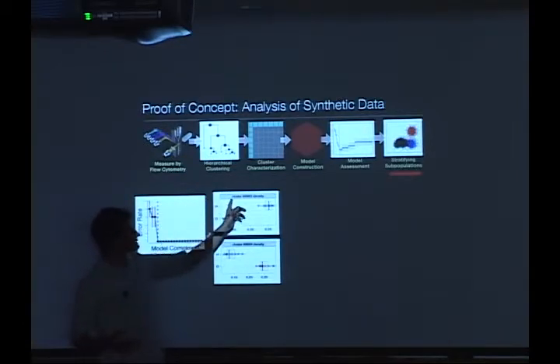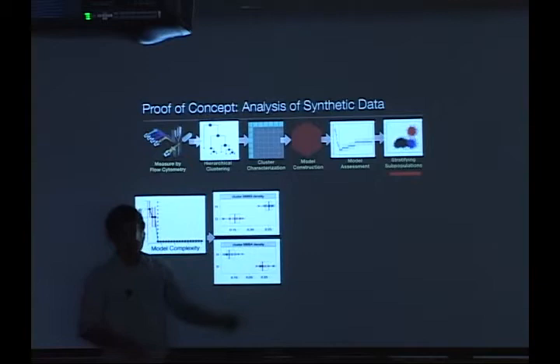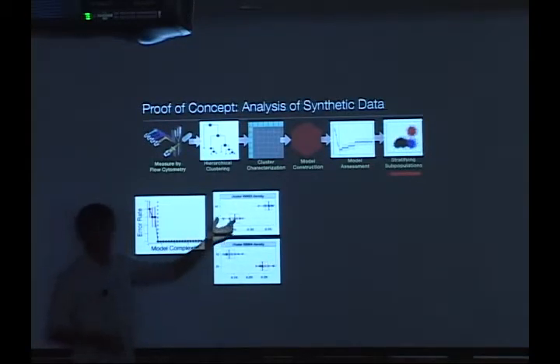So it'll say something like this. It'll say cluster 99993, which is just an arbitrary number. The abundance of that cluster is very high in healthy patients and very low in diseased patients. And so each dot here represents a healthy patient, as I specified, and each dot here represents a diseased patient. And we can see, yes, that the healthy patients have lots of cells in cluster 99993, and the diseased patients do not have a lot of those cells. And in cluster 99994, it's switched. Healthy patients don't have a lot of those cells. Diseased patients do have a lot of those cells.